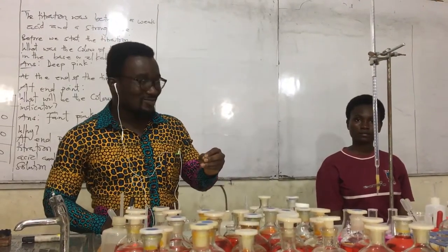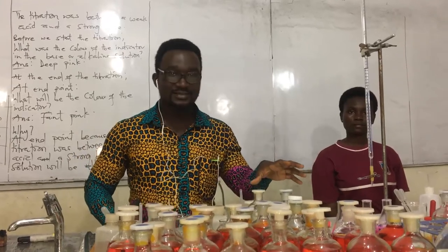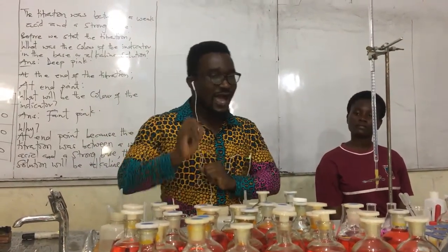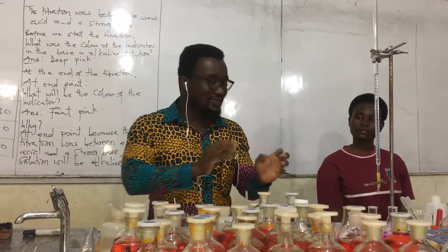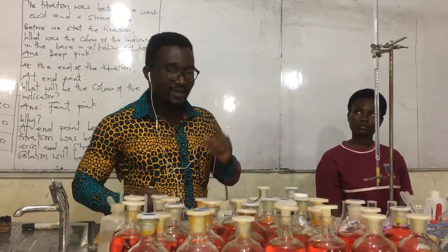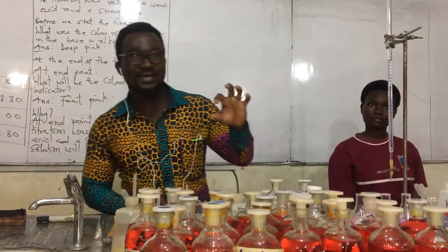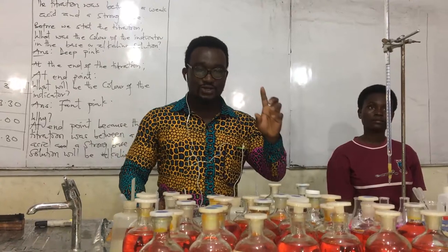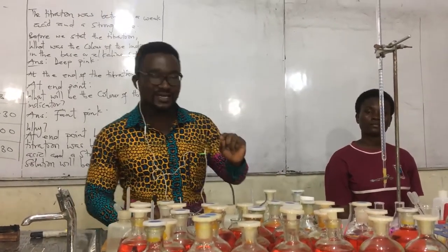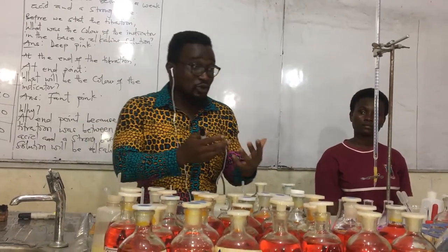So she's going to also help us to titrate the strong acid against a strong base. In fact, we have already learned the theory. I will also introduce the theory as we are looking at the practical so that we know what color is expected of us. Because we are going to titrate a strong acid against a strong base, you bear in mind with me that the indicator that would be best and appropriate for this medium should be methyl orange.